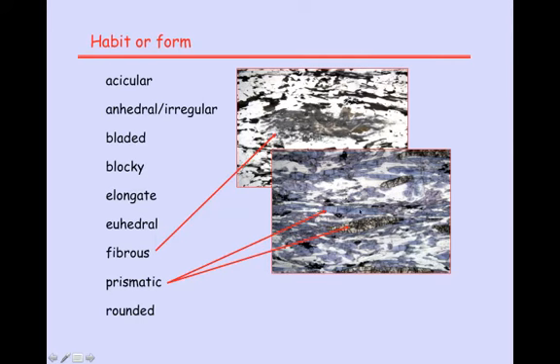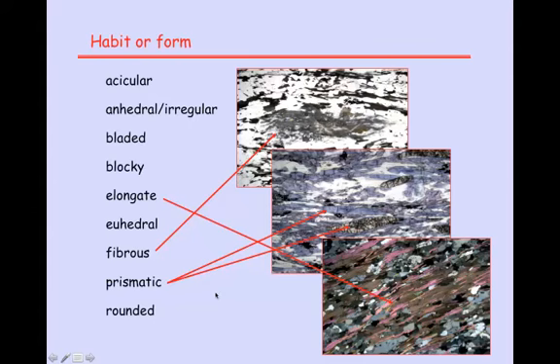You might call this bluish crystal prismatic too, or maybe elongate would suffice. Here are some muscovites, and it looks like biotite in this lower thin section. And those aren't fibrous like the upper image, but they're elongate. They're not blocky because they're thin, elongate crystals. So I would go with just elongate.